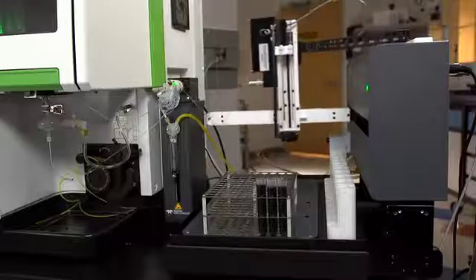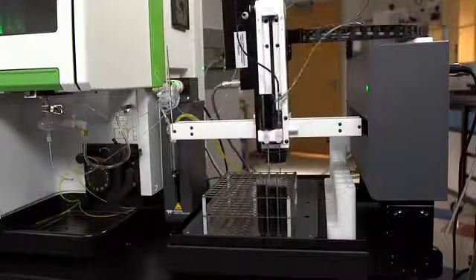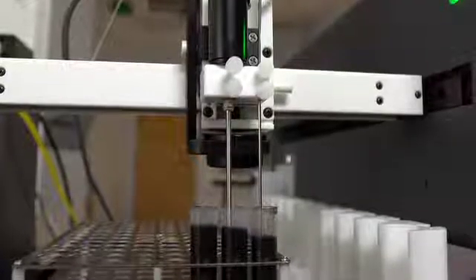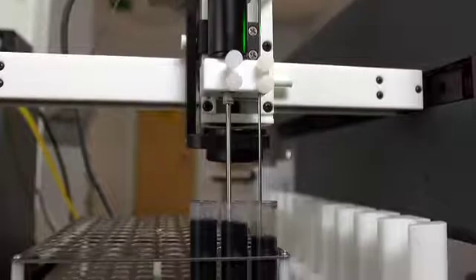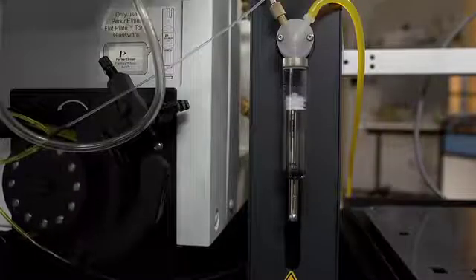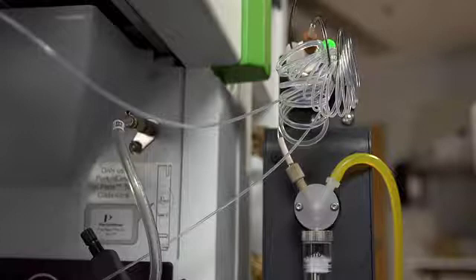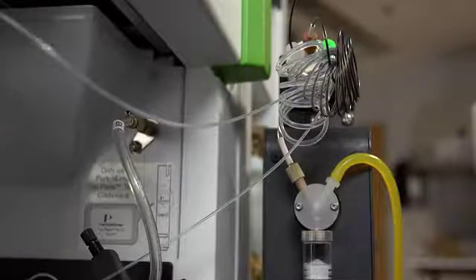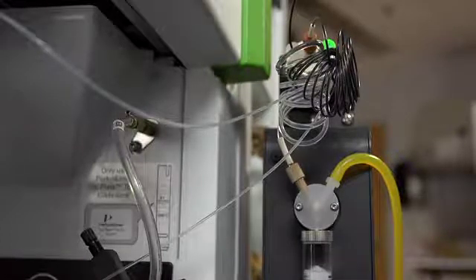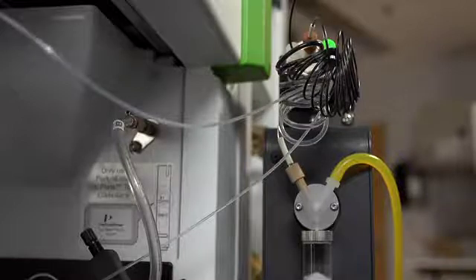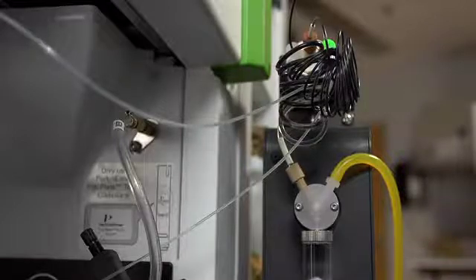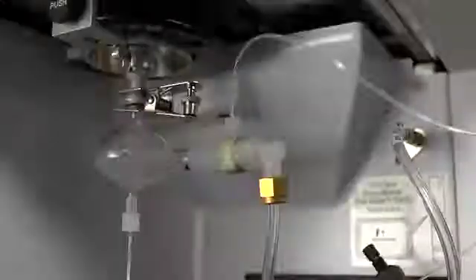The sample probe goes to the sample, the syringe draws the sample up the probe and through the cell of the optical sensor. While it is filling the loop for ICP analysis, the particle counting analysis is taking place. Once the particle count analysis is over, the loop is full and the valve switches where the peristaltic pump now feeds the sample in the loop into the ICP sample introduction system.